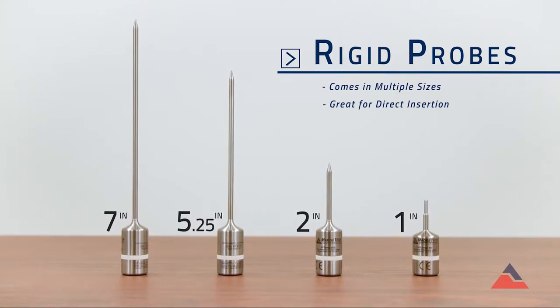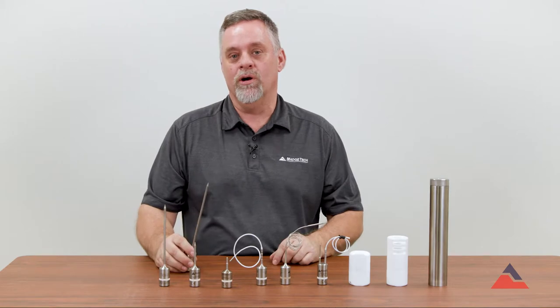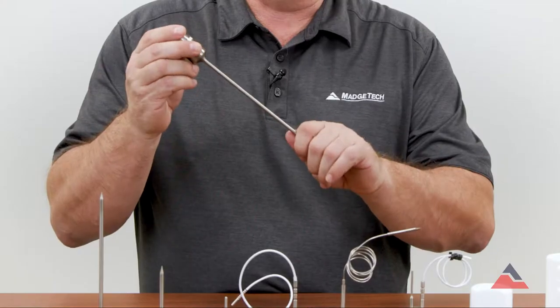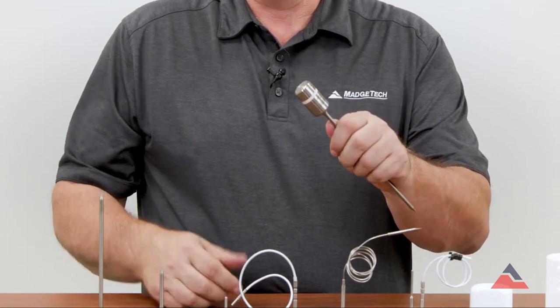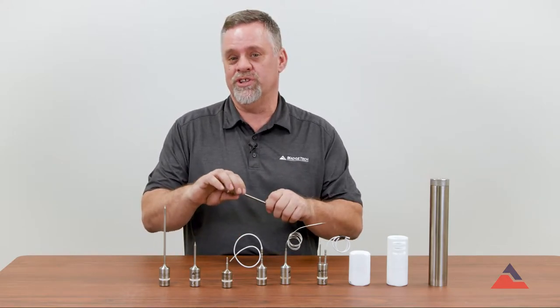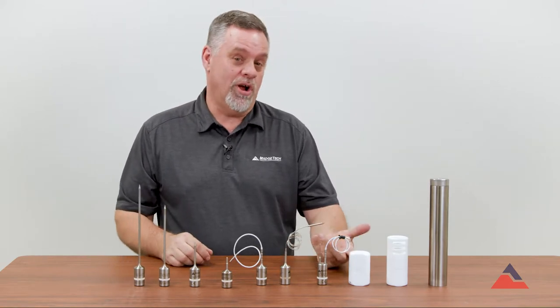The longer probes — the seven, the five and a quarter, the two — have pointed tips and these are perfect for meat and food processing applications where you're going to insert the logger into a product, run it through a cooking cycle, and monitor temperatures as it goes through to make sure you hit the proper cooking temp for that piece of meat or product.